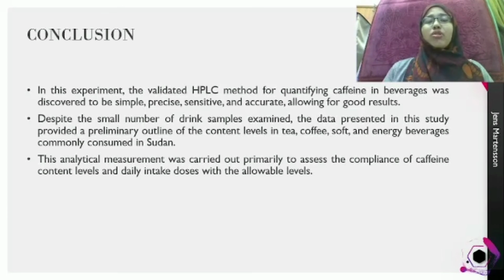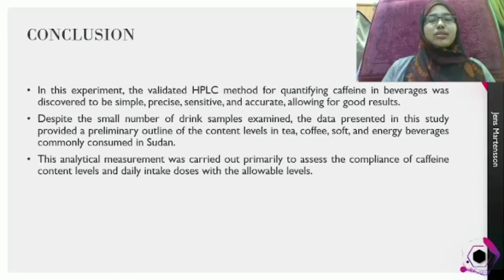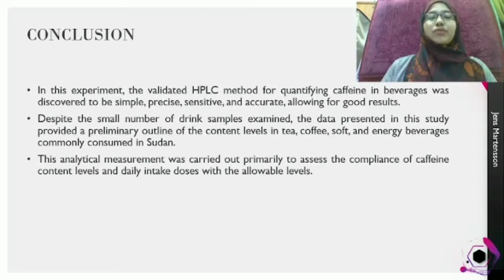Despite the small number of drink samples examined, the data presented in this study provided a preliminary outline of the caffeine content levels in tea, coffee, soft and energy beverages commonly consumed in Sudan. Lastly, this analytical measurement was carried out primarily to assess the compliance of caffeine content levels and daily intake doses with the allowable levels.